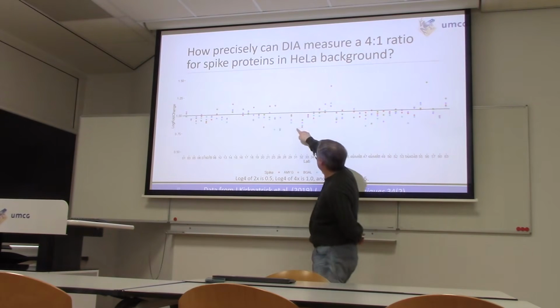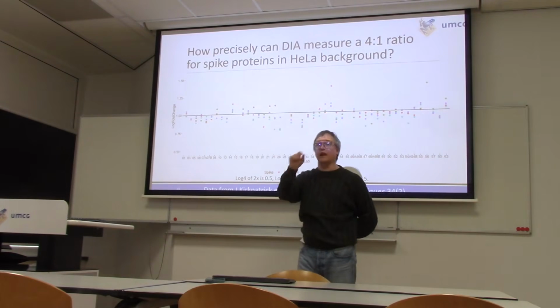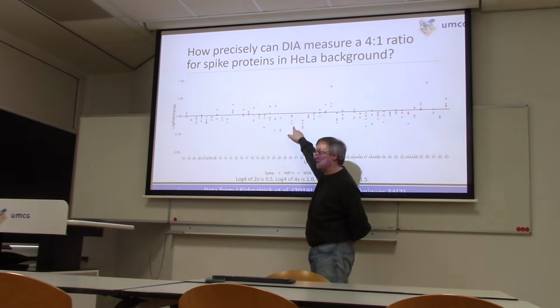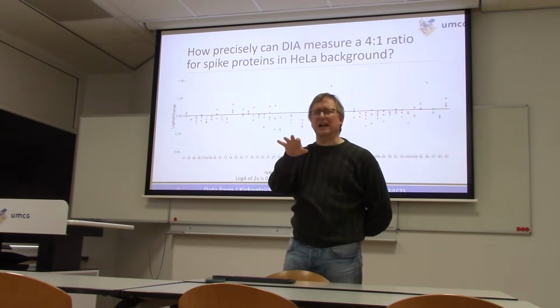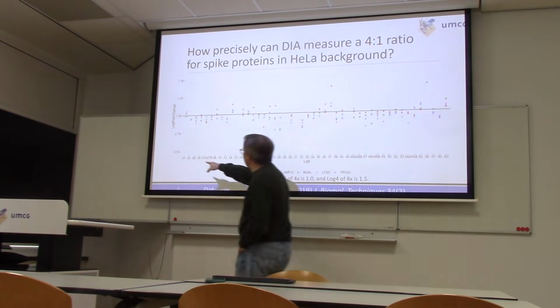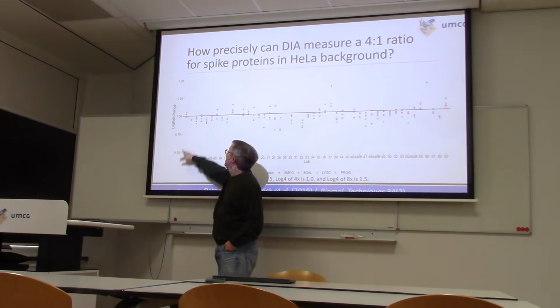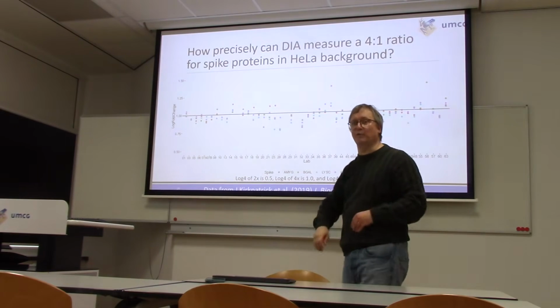Okay, so in this case, say lab 29, we see that all 4 proteins were observed and quantified, but all of them had a little lower ratio than you would have expected. Now, how bad, what would be unacceptable? In this case, I've opened up this graph to show a fourfold change right along that line, but this 0.5 line, this would mean that the labs claimed it was a twofold change when it was really a fourfold change. And that 1.5 up there, that would be the labs claiming it's an eightfold change rather than a fourfold change.